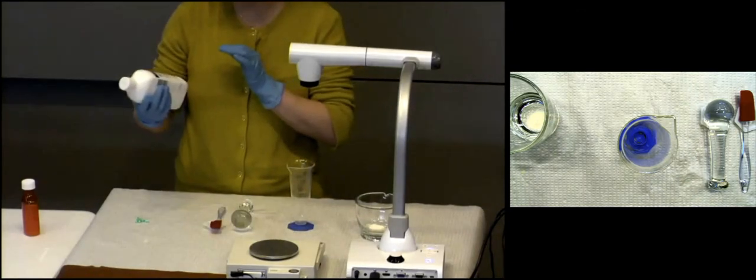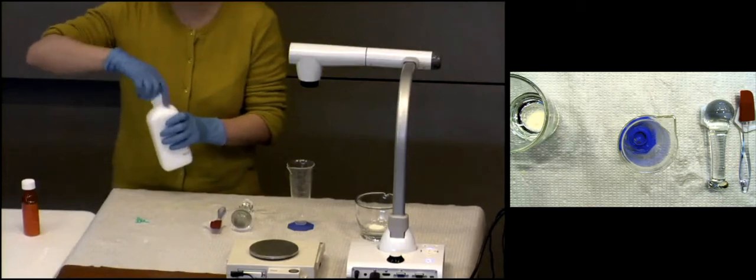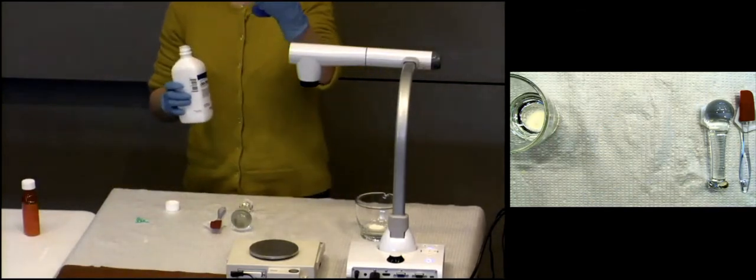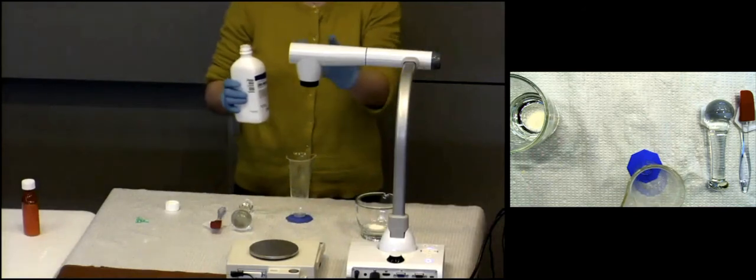I'm going to use Ora-Blend. Okay, so watch me before I open up. Make sure you shake really well. Of course, make sure the lid is on first before you shake. All right, so I'm going to measure 100 ml. By the way, what is this? What am I using? Conical. Great, that's a difference, right? P1 also has a cylinder.